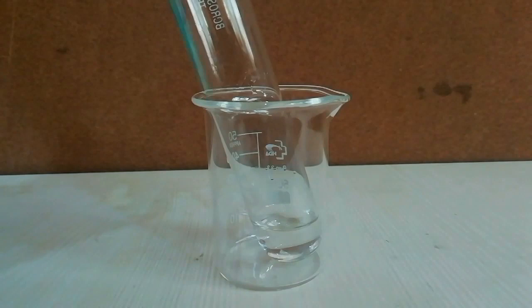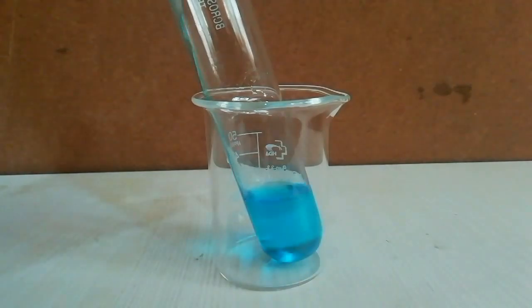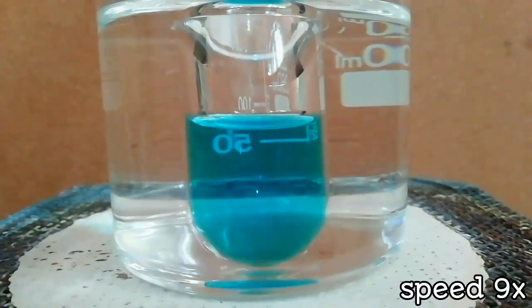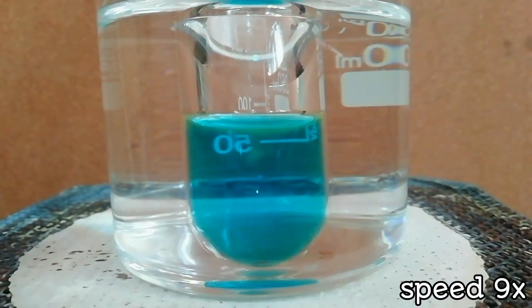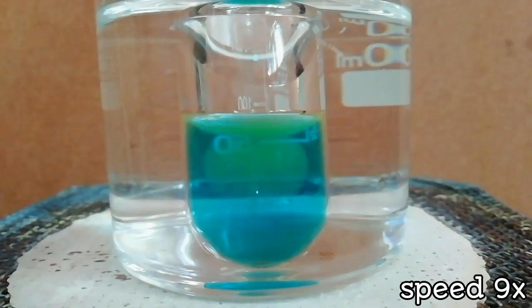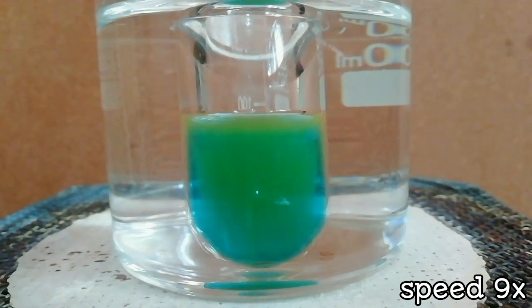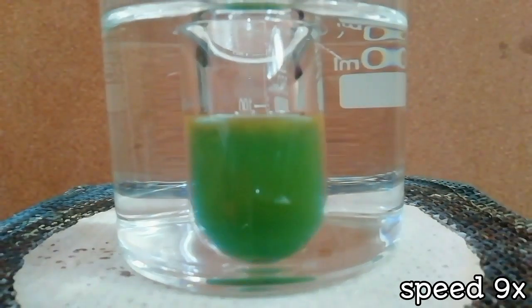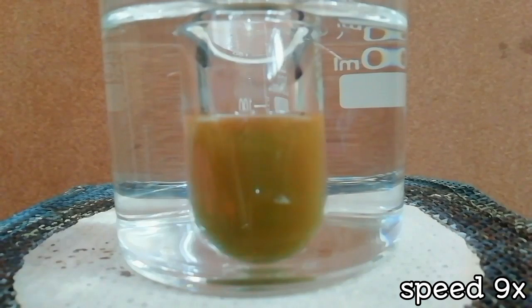Add equal volumes of reagent to the test sample and heat it by hot water bath. If the compound contains glucose, it will change to color blue, green, yellow, orange, and finally to brick red precipitate.